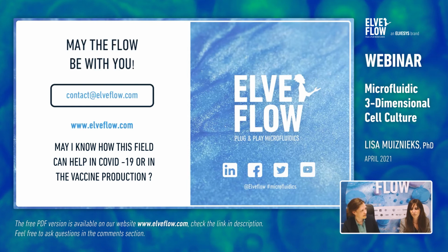So this is something that you can achieve with microfluidics. So producing, for instance, lipid nanoparticles and deliver then the RNA vaccine through that. So this is a tool that can be used definitely for COVID vaccines.